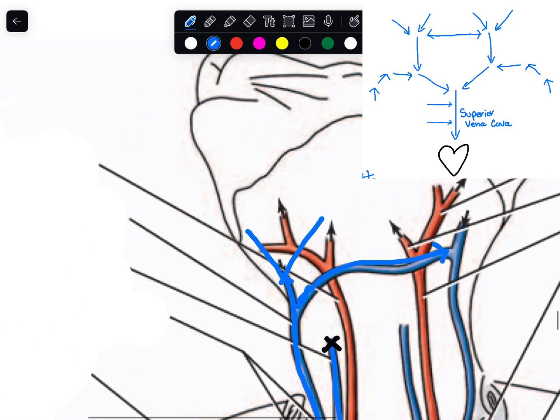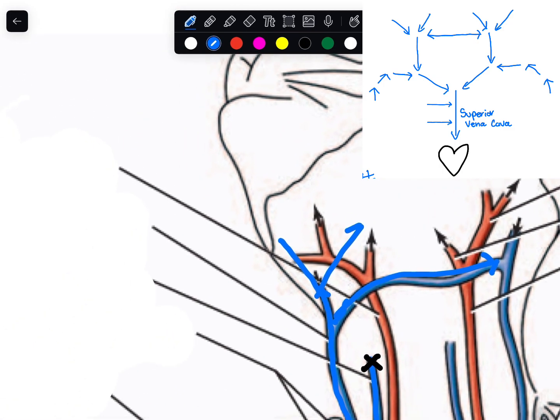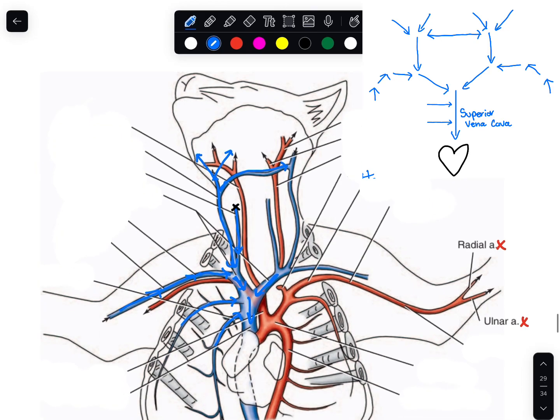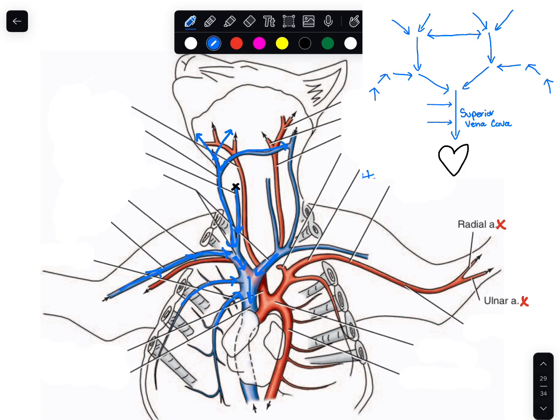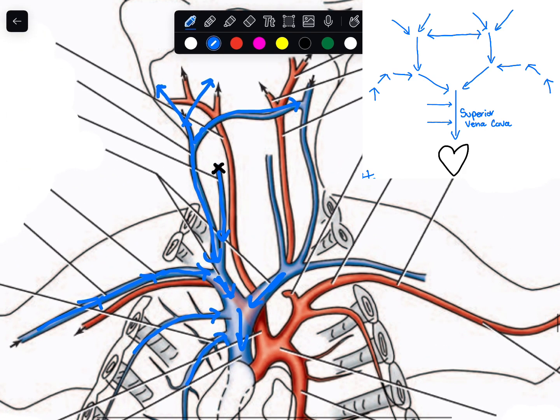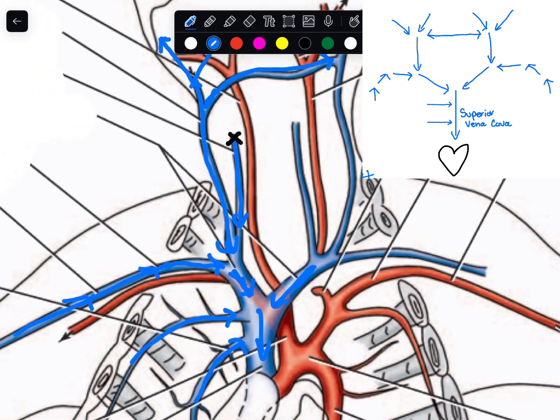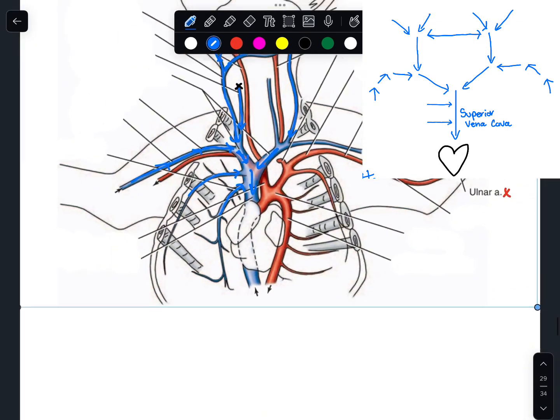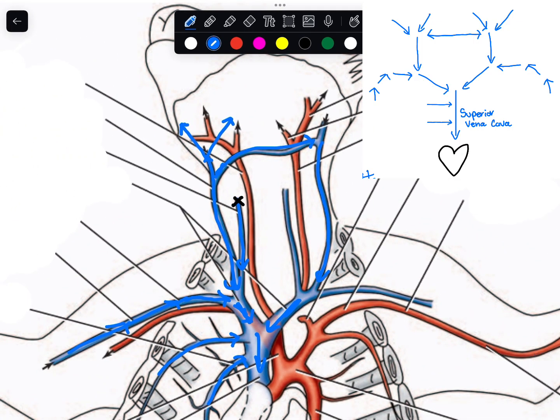And then the cat, I don't know why, but the model doesn't have it like this. But anyways, going inwards of the cat, this is the anterior facial vein. And going outwards, that's the posterior facial vein. Okay, that should be it with the veins in the top of the cat. Again, they both have the same name, just different directions. So if they ask you what this might be, then that's going to be the left side of the face, because we're looking at it from a different view. So their left is your right, if that makes sense. So this right here is the left external jugular vein.